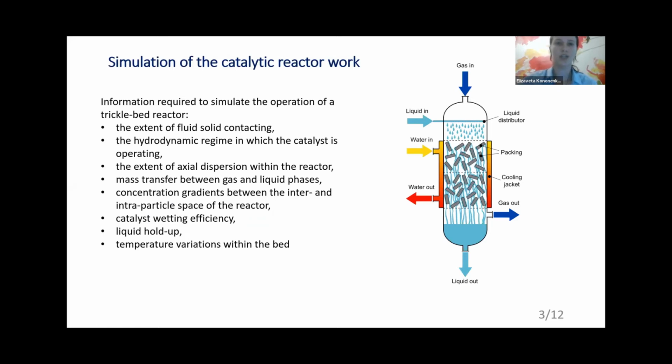In my presentation, I will talk about the methods that we develop to study heterogeneous catalytic processes using spin hyperpolarization and MRI. Heterogeneous catalysis is the basis of most industrial chemical processes, including oil refining, the production of pharmaceuticals, detergents, and much more. So even a small increase in their efficiency can be economically beneficial.